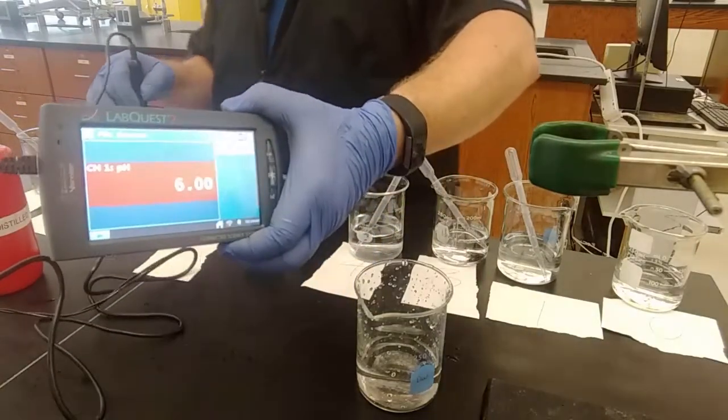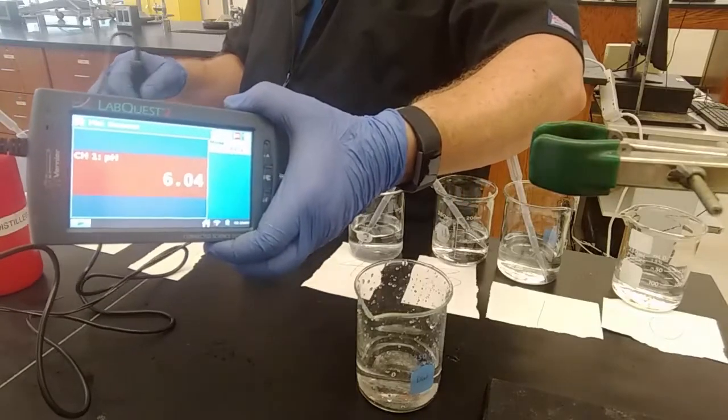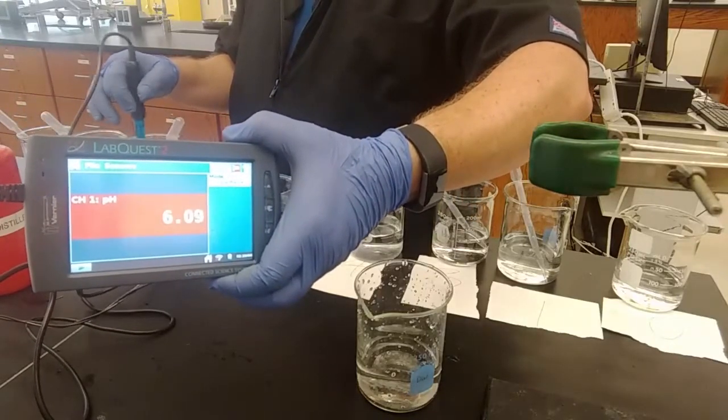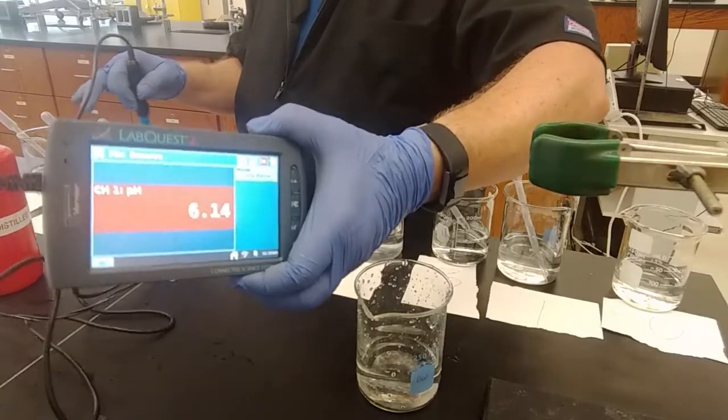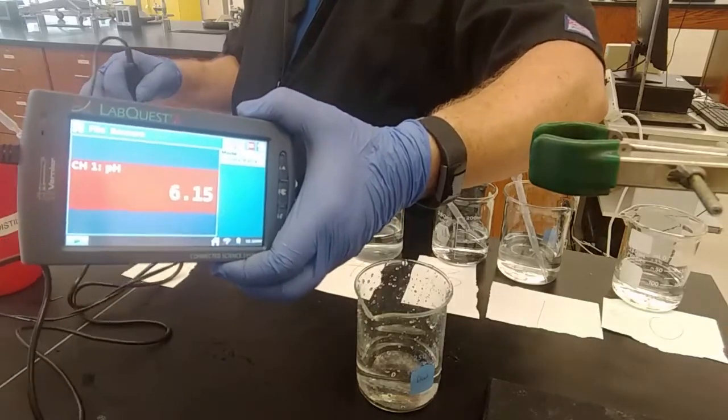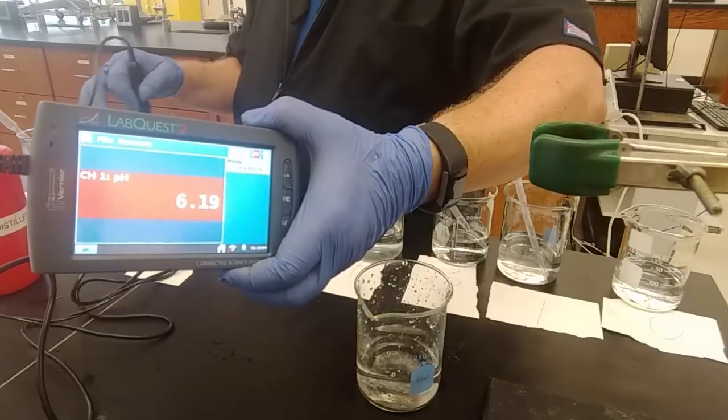Now, what this is going to screw up later is when we use our universal indicator, we're going to get not as pretty a rainbow of colors as I would have liked. But so be it.